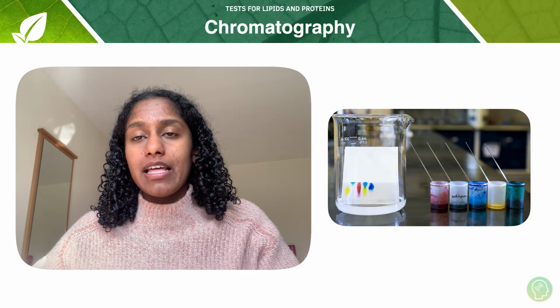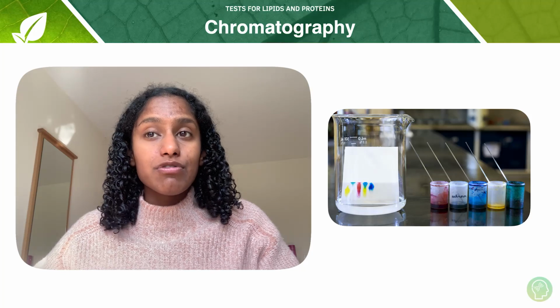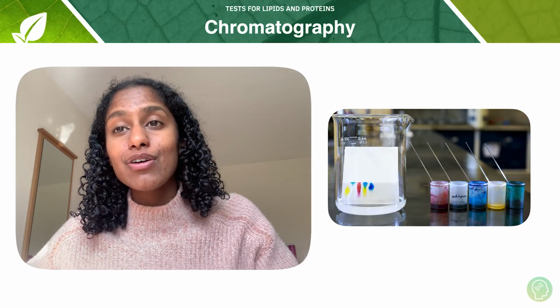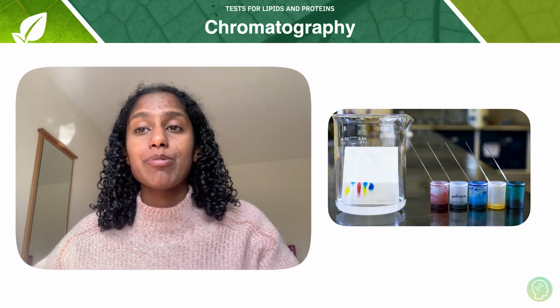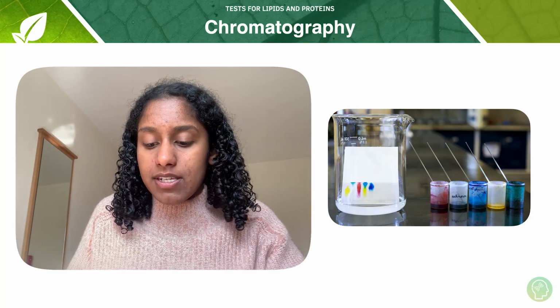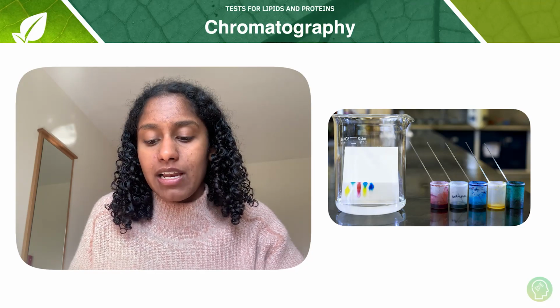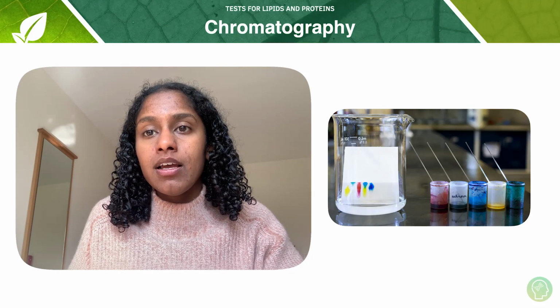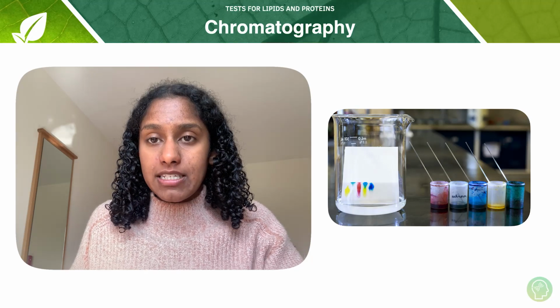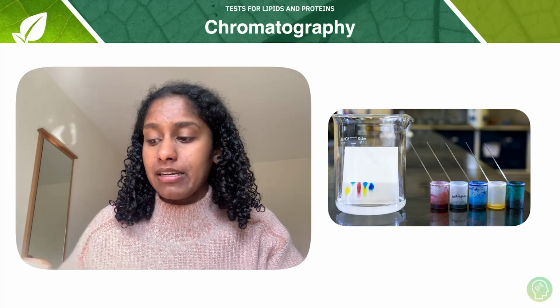So now let's have a think about a specific technique we can use called chromatography. So chromatography is a technique which can separate many different types of biological molecules in a solution. Now this can be proteins, this can be carbohydrates, this can be vitamins, or it can be nucleic acids. Now the two types that are commonly studied are paper and thin layer chromatography.